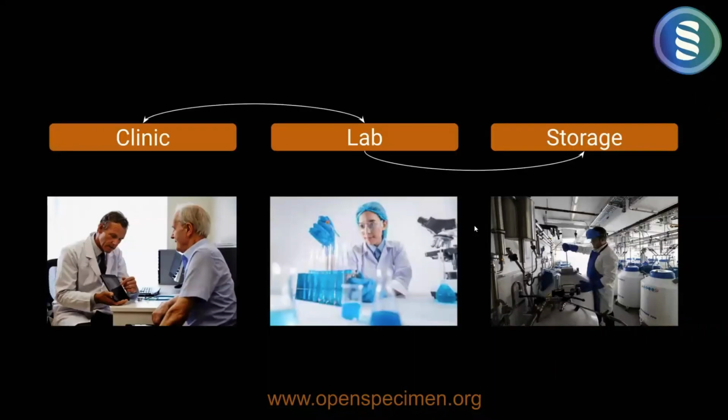As I was saying, there are three different touch points when you look at how a specimen travels, or the different classes of users in the context of OpenSpecimen. First, there is a clinic, where typically the nurses or clinic coordinators engage with patients in things like consent collection, registering a patient, and collecting questionnaires.